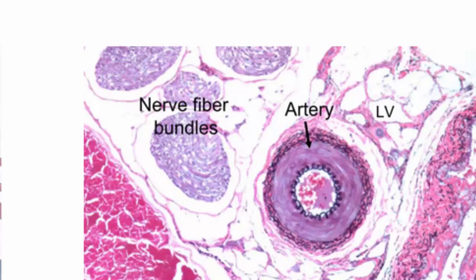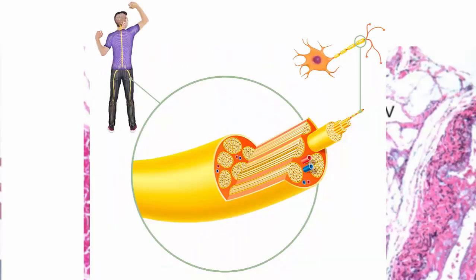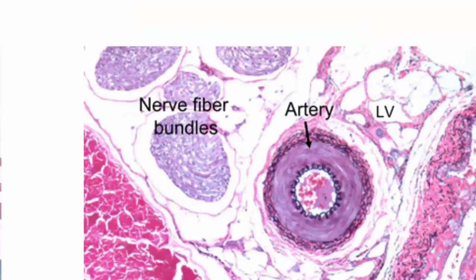The reason why is because what we're looking at there are cross sections through axons. Nerves are nothing but bundles of axons. So the nerves running through your arms right now are just bundles of basically electrical wires called axons. And when you cut them in cross section, you're just looking at a tube within a tube. So it's slightly nondescript.